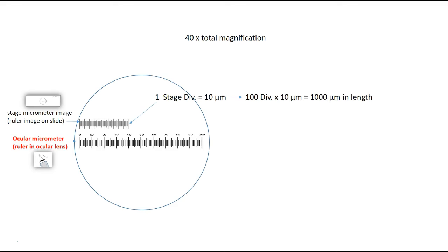If I switch out the slide micrometer and replace it with a specimen at 100x total magnification, I can see that my specimen is about 14 divisions long — it spans from division 12 to division 26, so 26 minus 12 equals 14 divisions. 14 divisions times 10 micrometers means that specimen is 140 micrometers in length.